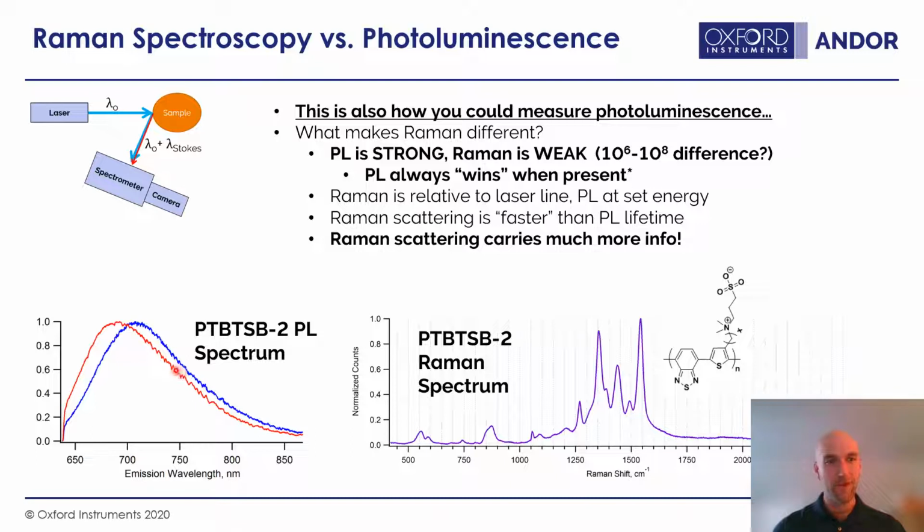Well, I could write down the center wavelength, or the wavelength maximum. I could give it some rating for skew, like it's hilled up in this particular direction. I could characterize that, perhaps fit a Gaussian with skew to it. And I can also include the bandwidth, so it has some very wide bandwidth here. With those three numbers, written down on a post-it note, I could probably reproduce the spectrum pretty well.